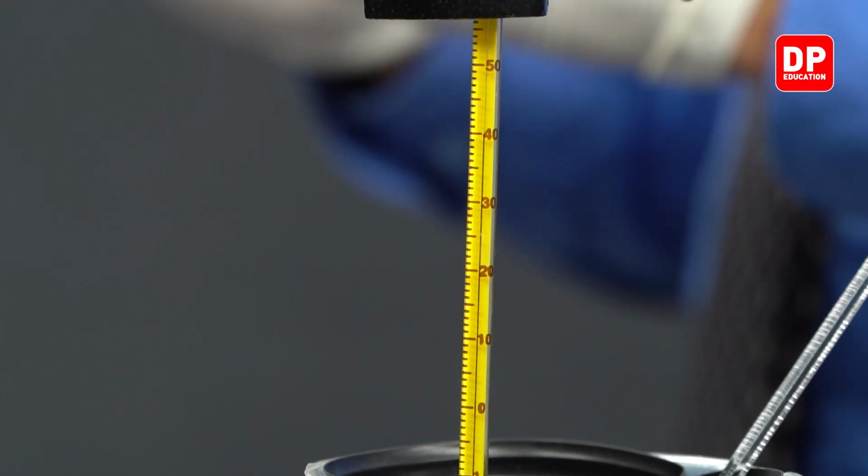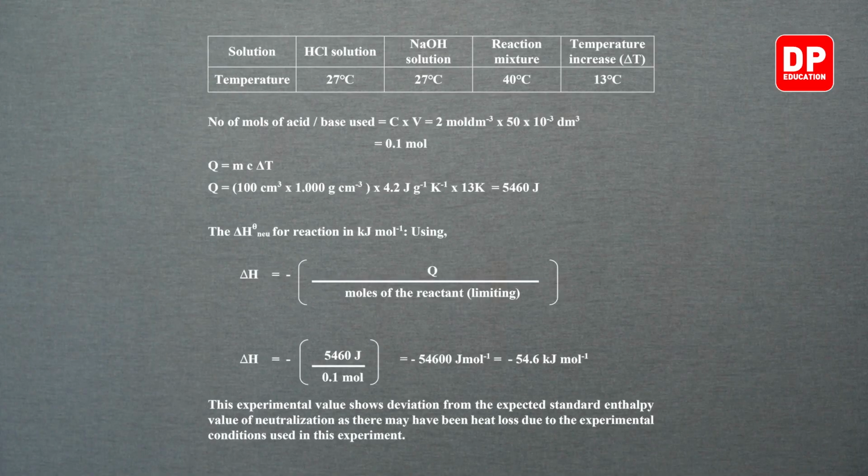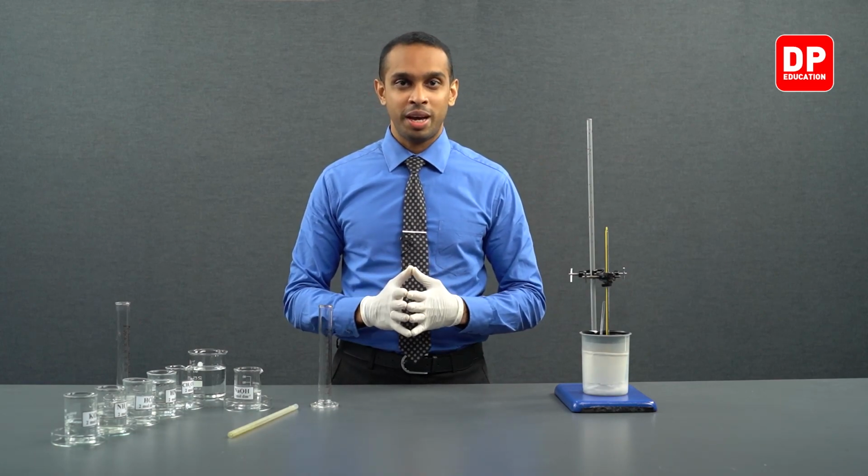So the highest recorded temperature when this reaction was taking place was 40 degrees Celsius. After recording that temperature, we can move on to our next reaction.